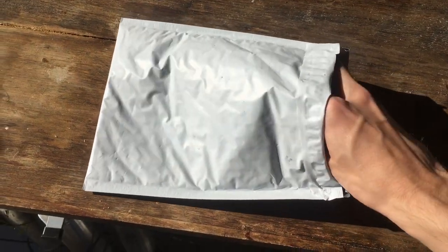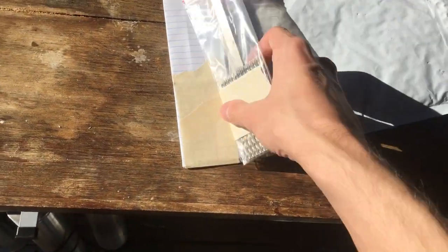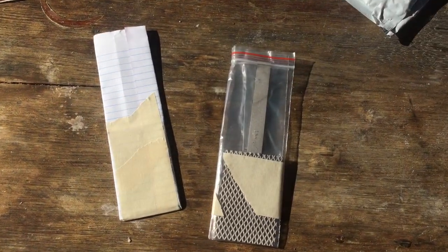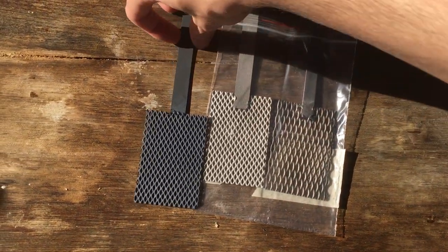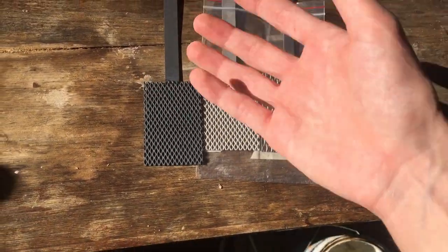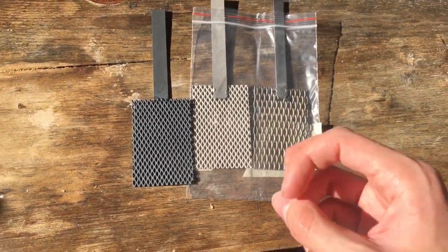Now that I've got it open, I will grab out what I've ordered. You can see what I have here is some fancy electrodes for future electrochemistry experiments. First off we have an MMO electrode, in particular for when I want to make a big chlorate cell, or possibly a more advanced chlor-alkali cell.